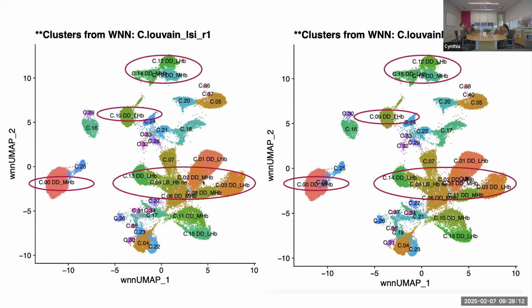So it just was to try to identify where are the clusters that we are looking at. In this case, we are looking at all the clusters that are identified here with an HB, all the clusters that have an HB referring to Habenula. Most of the clusters are in this cloud, some kind of mixed, but we can identify small subcommunities in this. That is why we use the silhouette approximation to try to identify these differences.